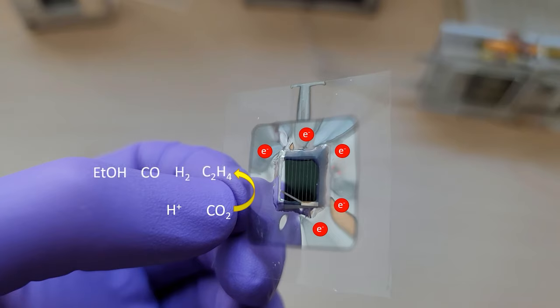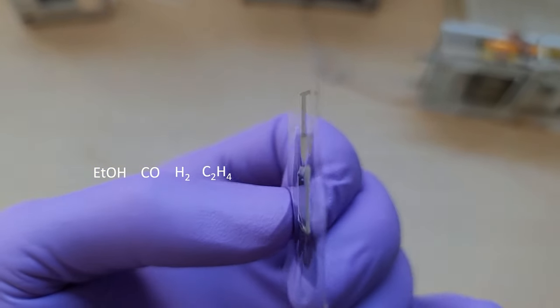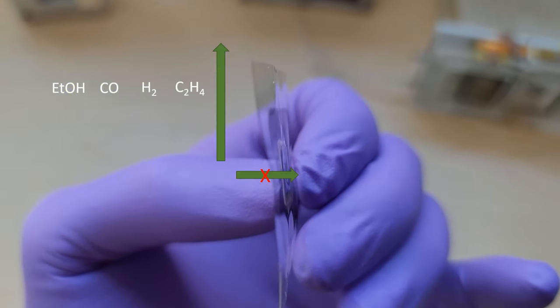When protons and carbon dioxide come in contact with this negatively charged catalyst, they are reduced, they gain electrons into chemical products such as ethanol, carbon monoxide, hydrogen, and ethylene. These products are blocked by the membrane so they can be collected, separated, and stored.